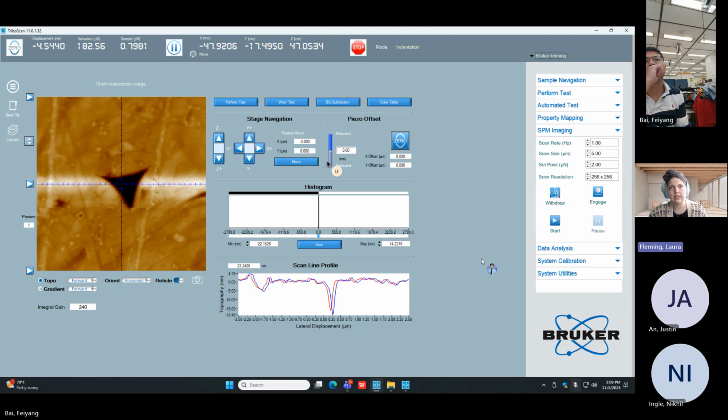And then the other question is the length scale of roughness. So is it locally rough, and there's a smoother part out here you can test? Is it generally rough, like the Rocky Mountains are rough, where there's valleys in between them that are nice and big and wide, that you can indent into there? So it really depends on your sample and what you're looking at.